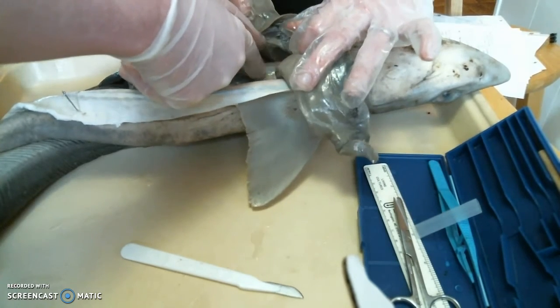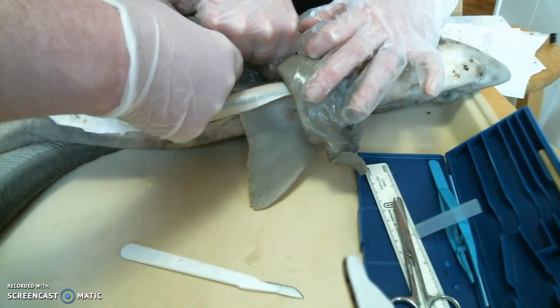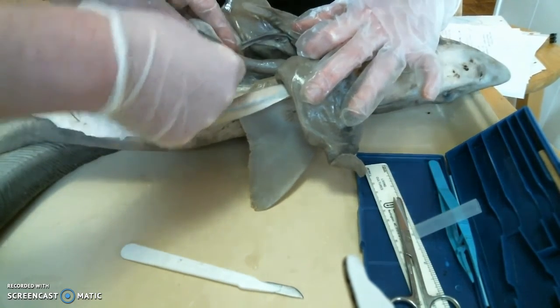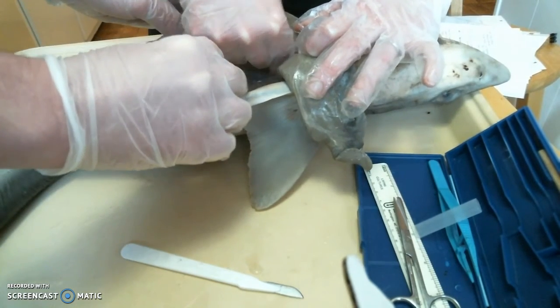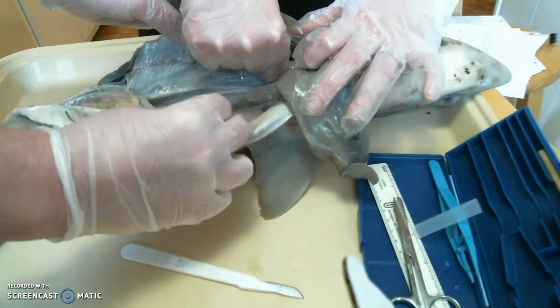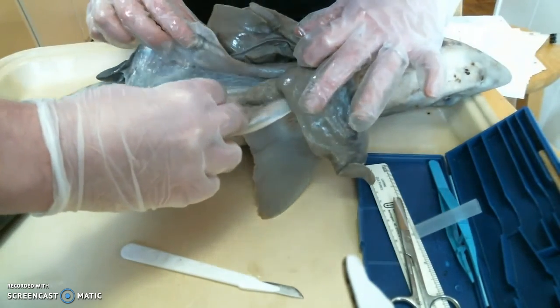Okay, now we can see it as we lift away all the lobes of the liver. There does seem to be something that's a little bit more tube-like in the center. Seems to be right up against the spine. Right up against the spine in the center, there is something very hard. It's a lot harder than the other things. That might be the esophagus. Maybe I'll have to watch some more YouTube videos.